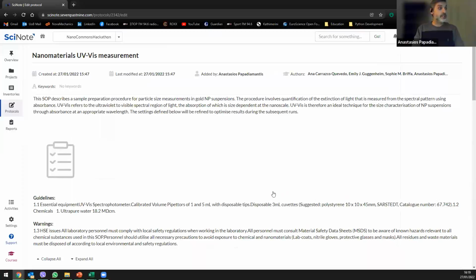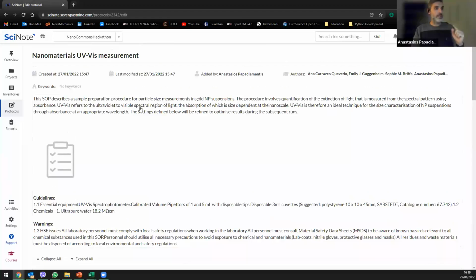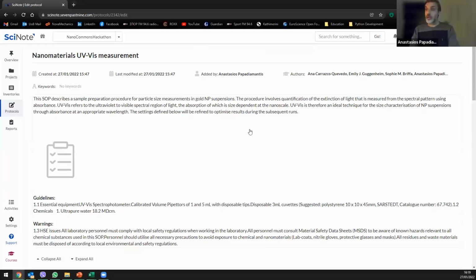That's the thing, that if protocols change over time, let's say if you modify it within a workflow, within a task, then you can directly save it as a new protocol. Because let's say if I add the protocol and Thomas does the experiment and changes something in the protocol and updates it, he will not be able to overwrite my protocol. The other way around is possible.